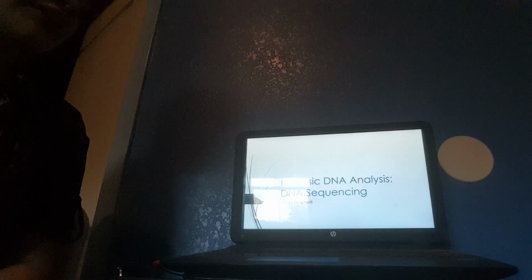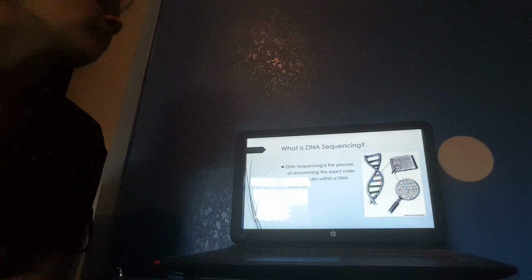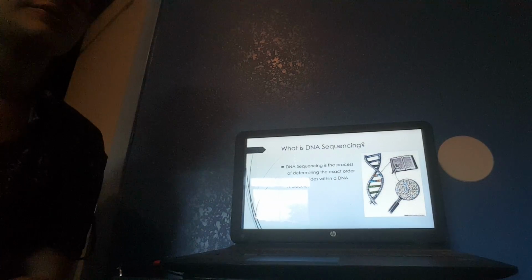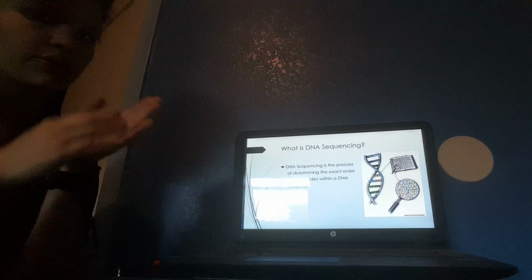Hi, my name is Sarah Pritchett, and today I'm going to be talking to you guys about DNA analysis, more specifically DNA sequencing. DNA sequencing is the process of determining exactly how your adenine, thymine, cytosine, and guanine go in a line.